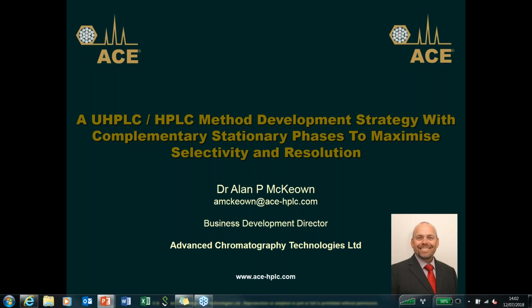As Ian said, today I'm going to be talking about the importance of selectivity and maximizing selectivity for your separations. One approach, one method you can use to do this is through complementary stationary phase chemistries. Today I'm going to discuss some of these different types of phase chemistries and their mechanisms of interaction, and also show some examples and data of how we can use different stationary phases to achieve the separation that we're after in a quick and efficient manner.